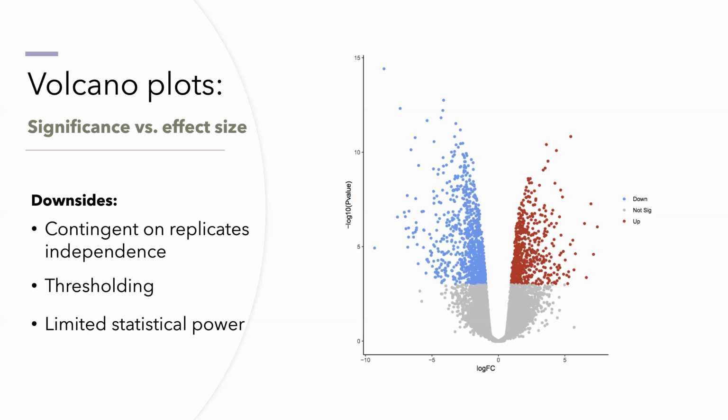For example, if all ribosomal proteins are just below the threshold of significance shown on this volcano plot, while we may not be able to compute a significant p-value for an individual ribosomal protein, we might be able to compute a very confident estimate that ribosomes as a whole are changing between the two conditions compared here.